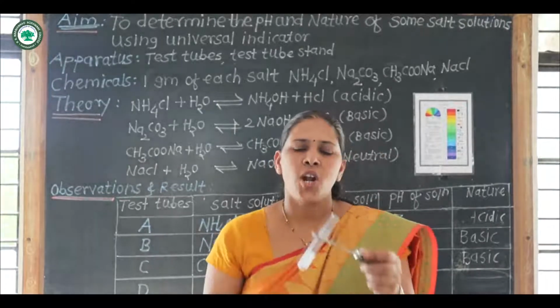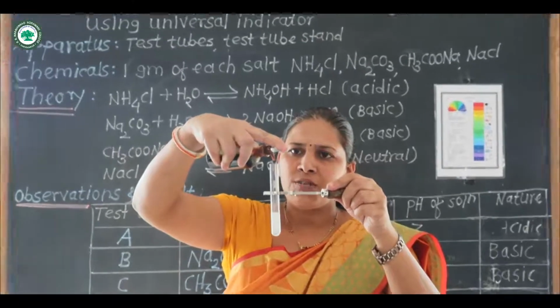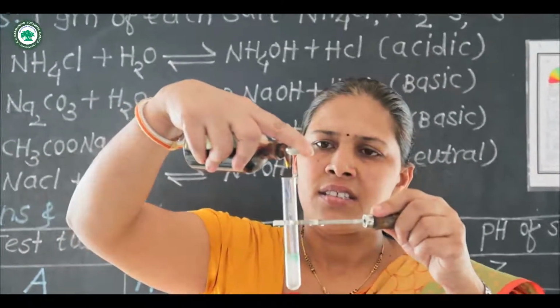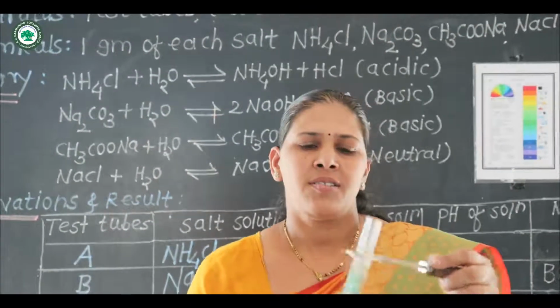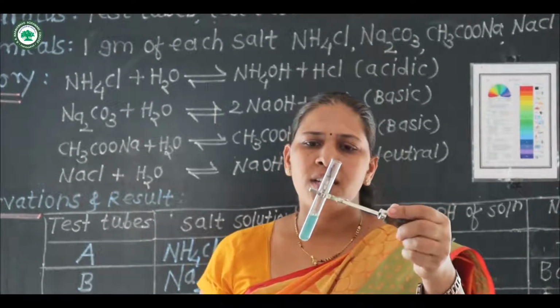After dissolving the salt in water, then add 1 to 2 drops of universal indicator. Stir the solution and observe the color.